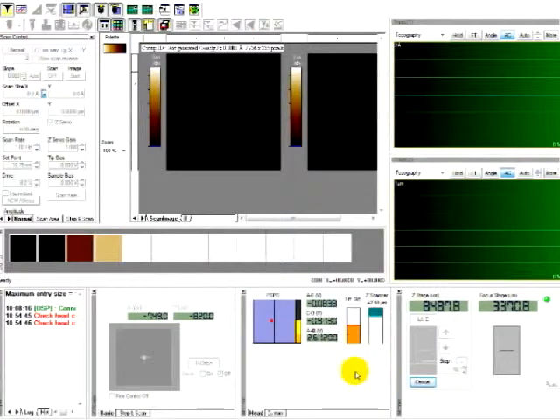As you acquire a non-contact image, you can also check other signals, and you can click on input configuration. As soon as approach is done, then all those icons will be activated. While approaching, none of these icons will be activated at all.